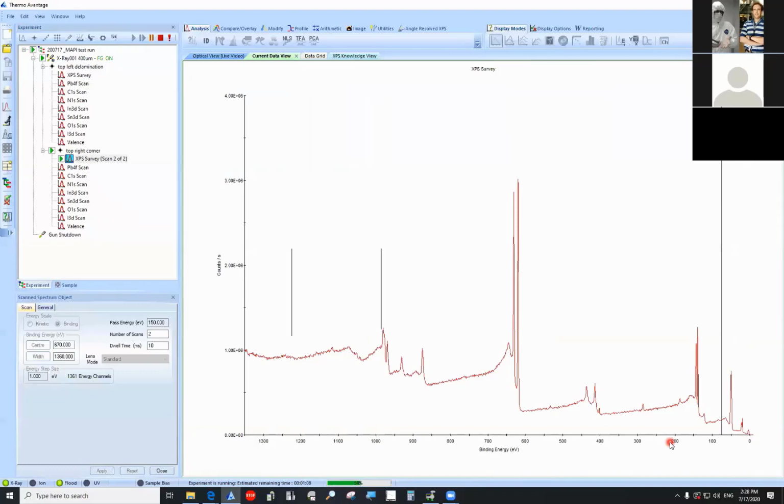So it finished scan number 1, and now it's basically going through pass number 2. When this finishes, I can go ahead and take a quick look at which peaks it identified, and we can just confirm that the elements of interest are in fact present here. And we'll also, I guess, answer the question as to whether or not Craig was right and we do end up seeing the substrate, the tin or the indium.